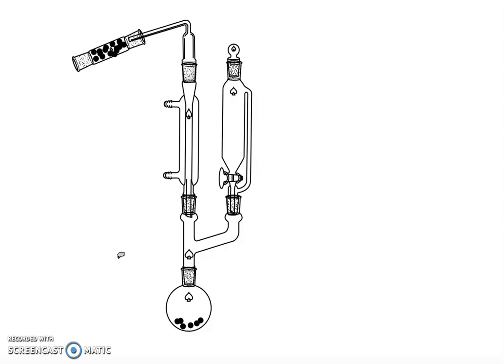We're going to set up our equipment with a round bottom flask, a Claisen adapter, and the Claisen adapter is going to be attached to a condenser and a dropping funnel.